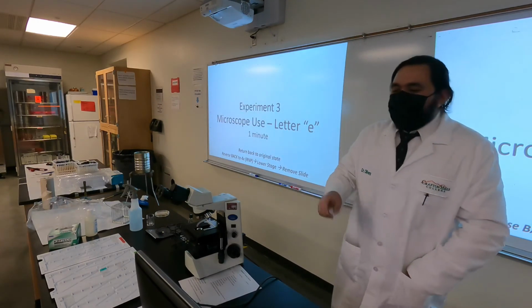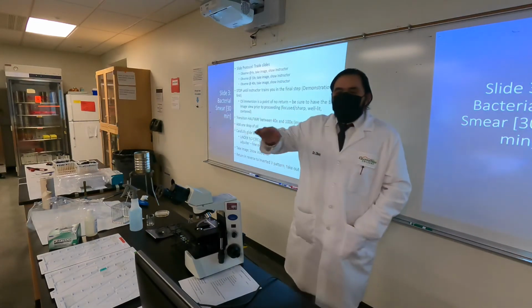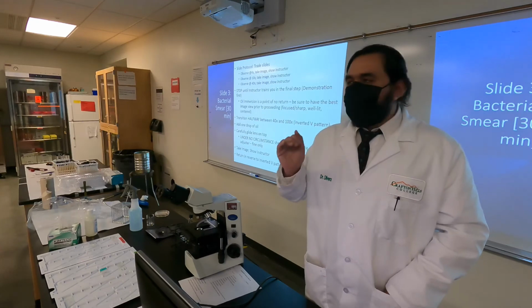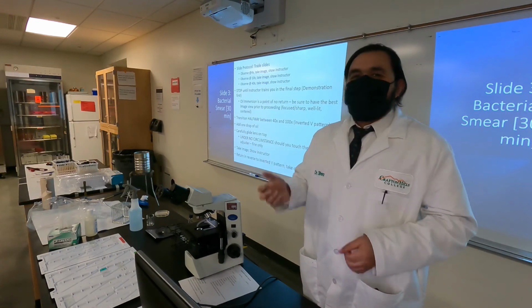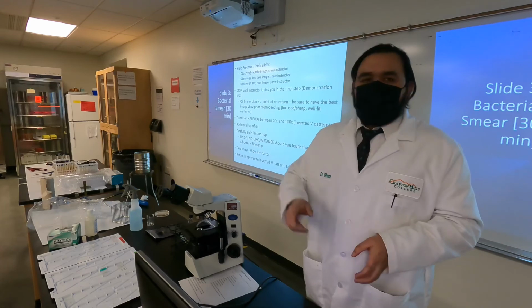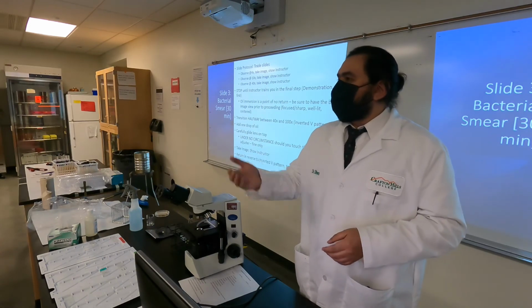Okay, now we're gonna move on to the next one, which is gonna be our last step for today, and we're done. So we're going to grab our third slide, which is gonna be our bacterial smear, and now we're gonna look for our 4x first. So that's where we're gonna spend our first time. Look for it and take an image of it so you can show me, or again, pictures or it didn't happen. So take out your letter E, replace it with your bacterial smear, find it at 4x, take an image, and then we'll go through all the 3 steps as we go.